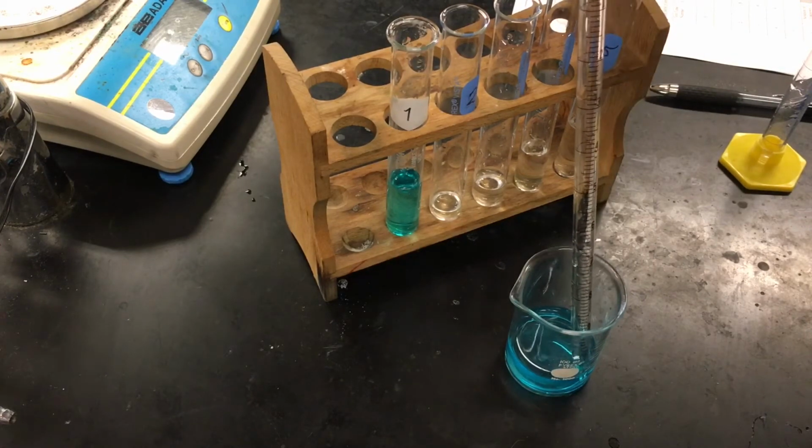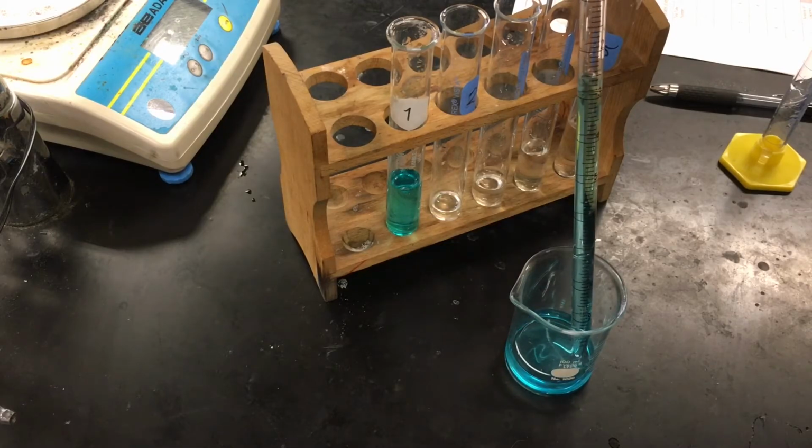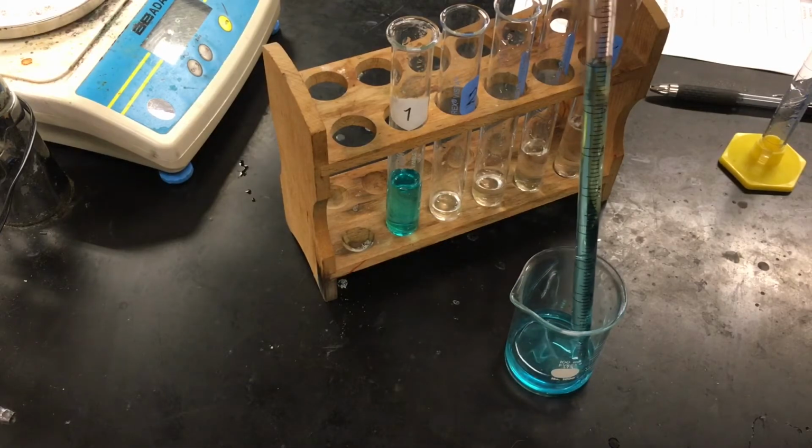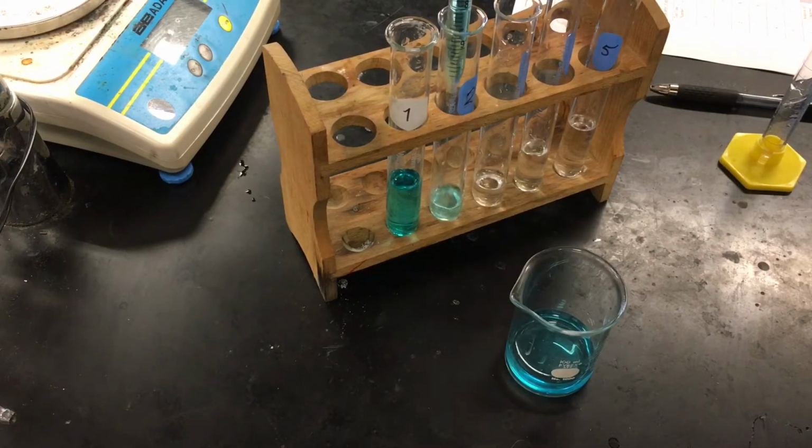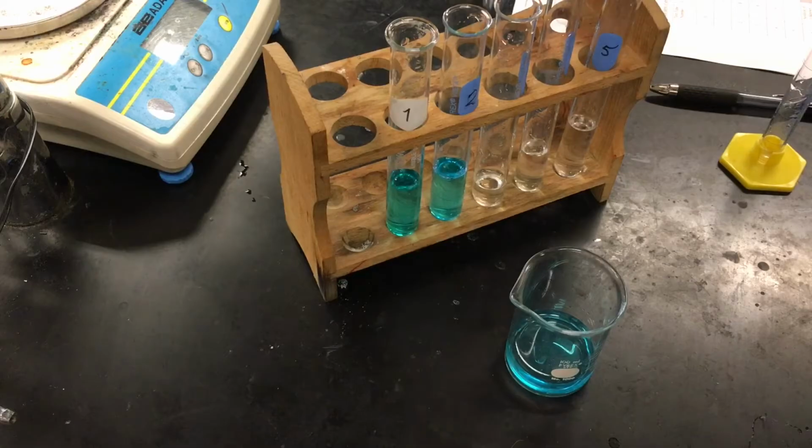And then we're going to put 8 milliliters in the second. And 6 in the third, 4 in the fourth, and 2 in the fifth. Our dilutions are made.